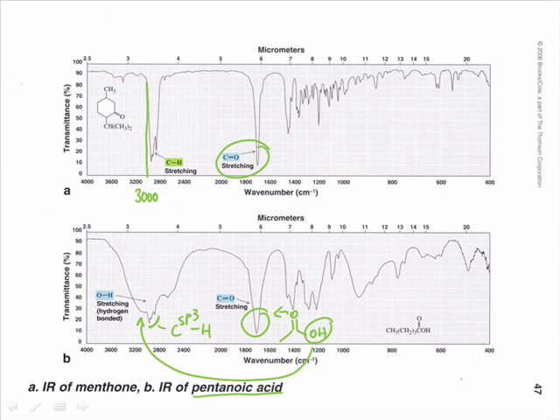But there is really quite little that we can do beyond that, because IR spectroscopy will probably not be able to tell us the difference between this thing or an isomer, which will be this, because they would have the same functional groups, they will both have alkyl substituents on here, and IR spectroscopy really would not be able to help us distinguish.